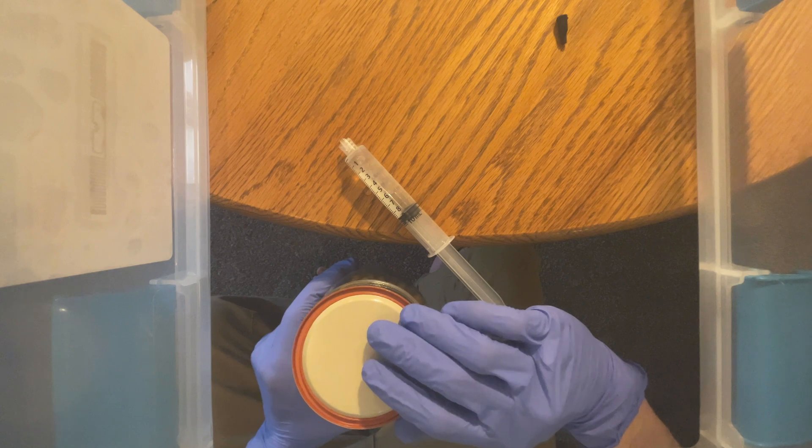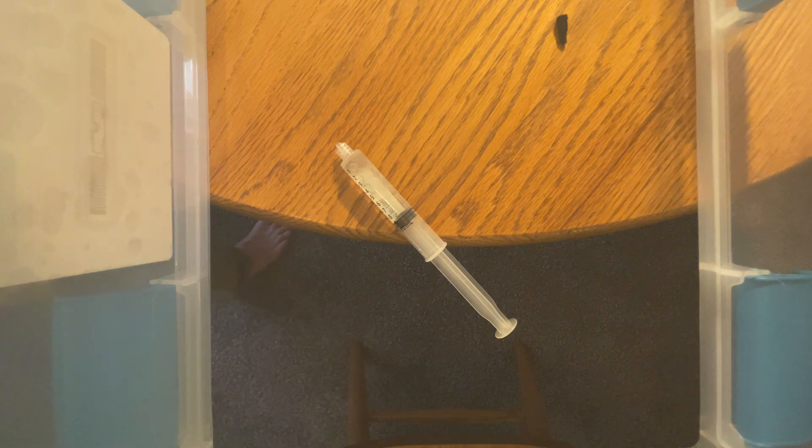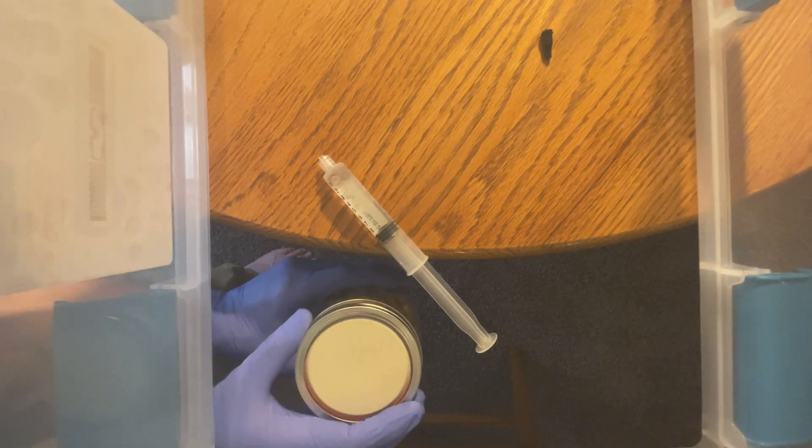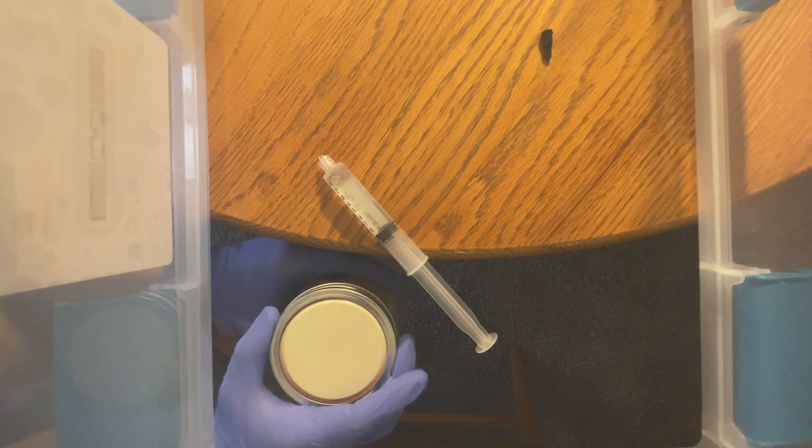Make sure that you're flipping the lid each time that you inoculate, as you want the mycelium to get some sort of airflow so that they can start to grow since they intake oxygen and expend CO2. Another thing I'm making sure of is to keep the lids on just a half rotation. This ensures that the lid doesn't seal again so that you can get airflow.